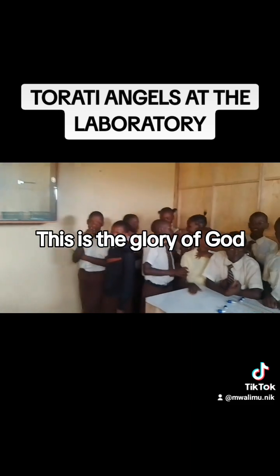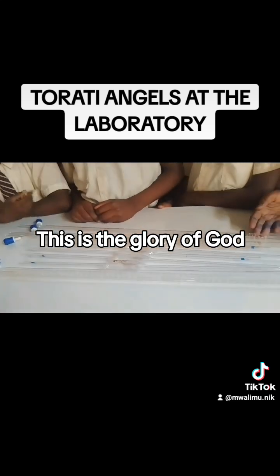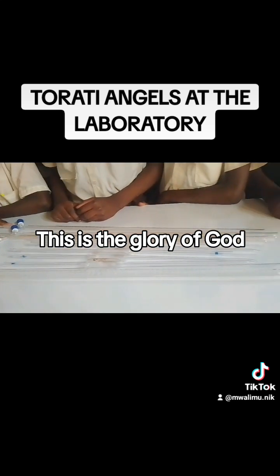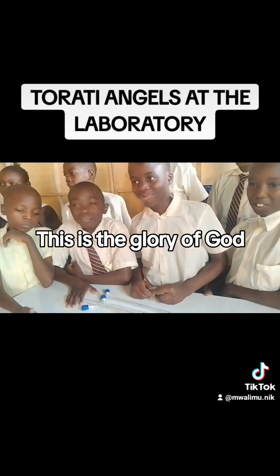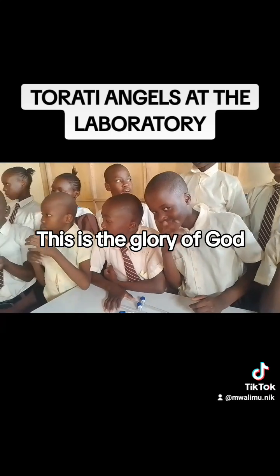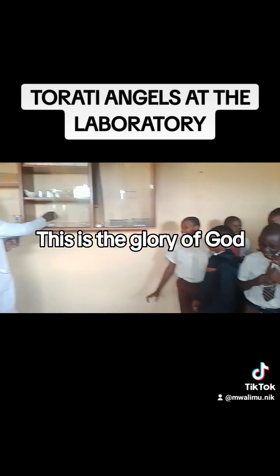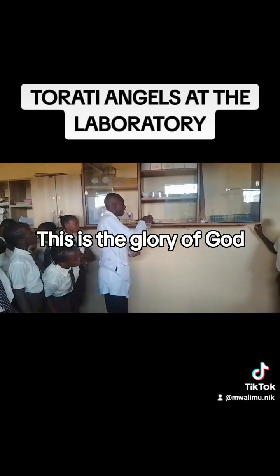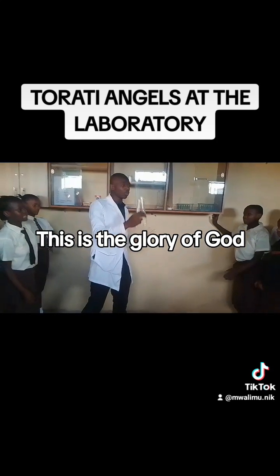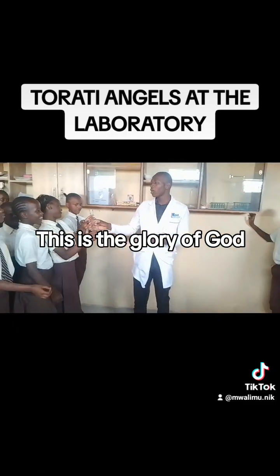Let us now proceed to another instrument that can be used to measure volume. Another one, we have the measuring cylinder. So we have the measuring cylinder. This one is also used to measure volume.